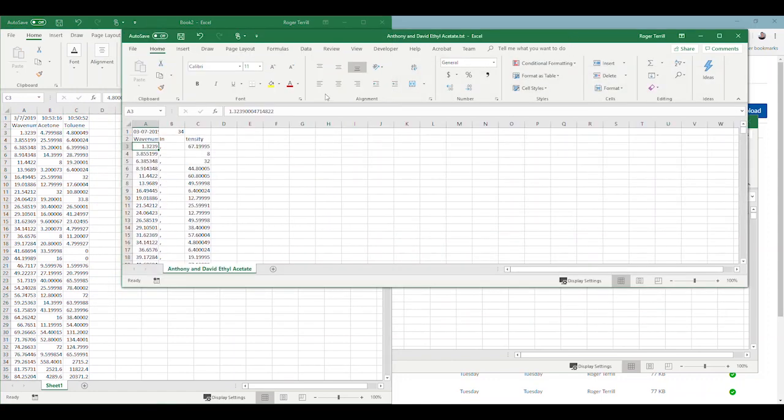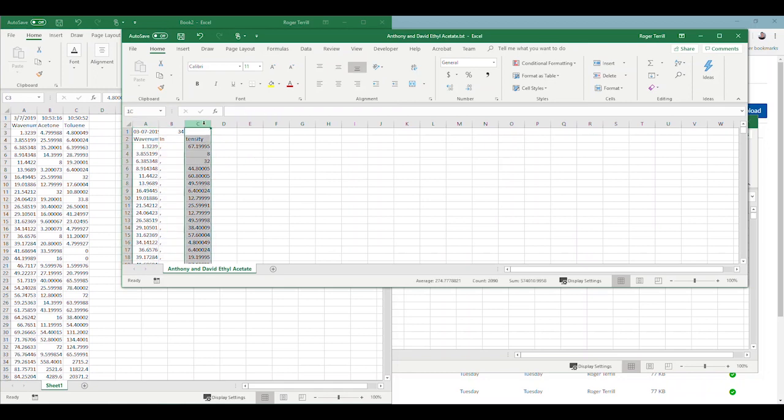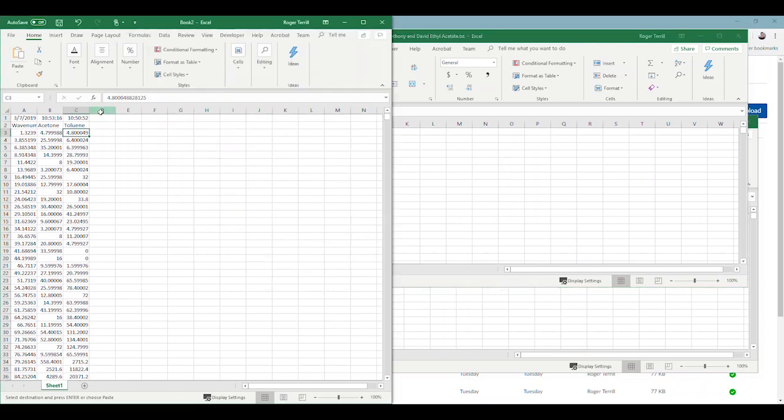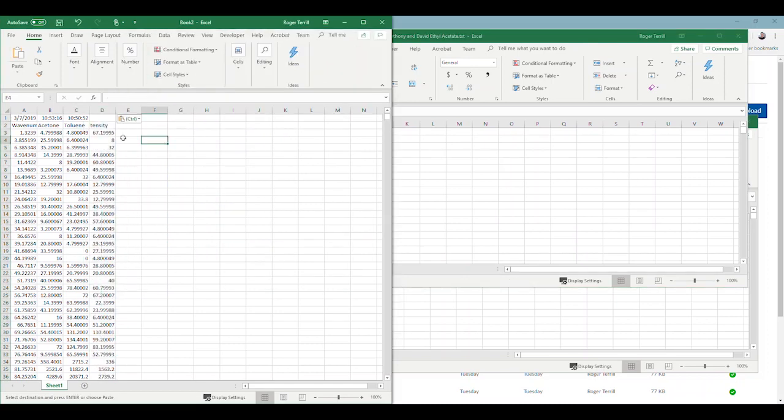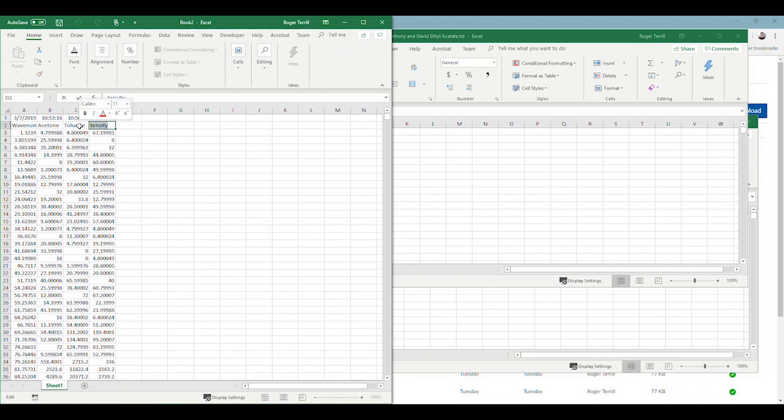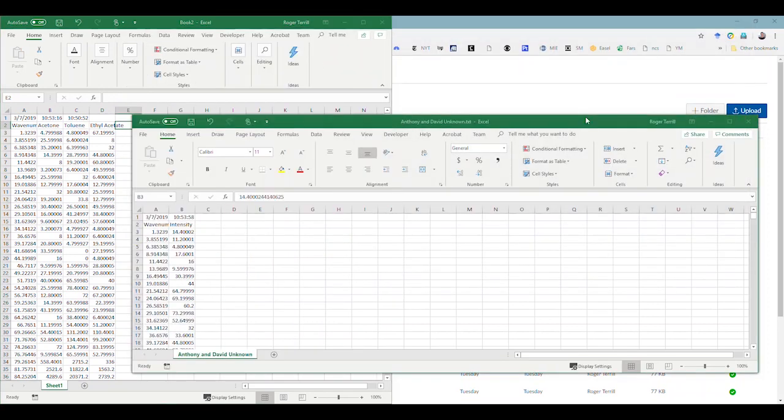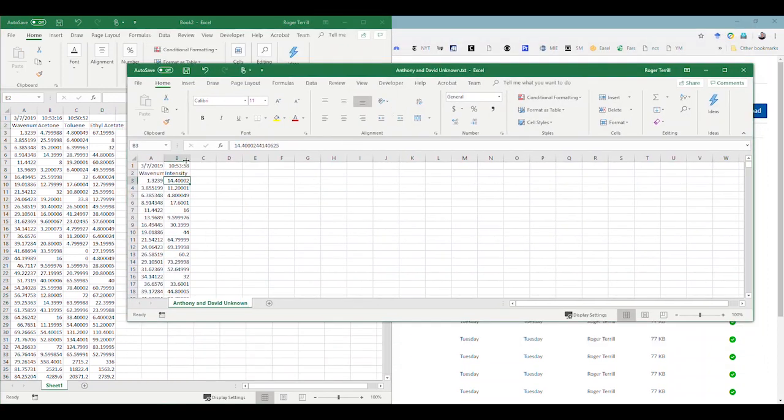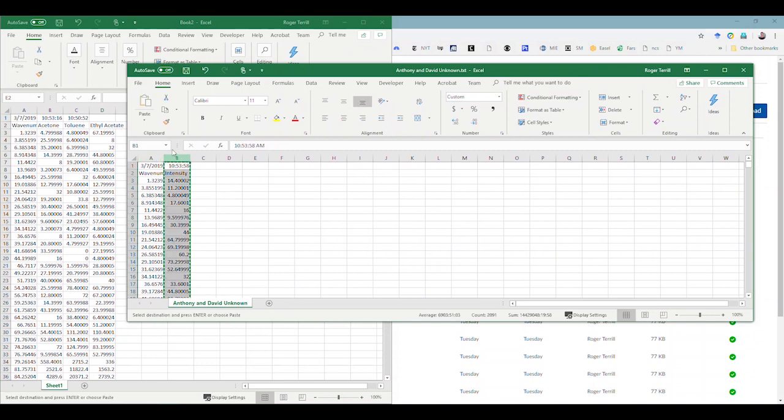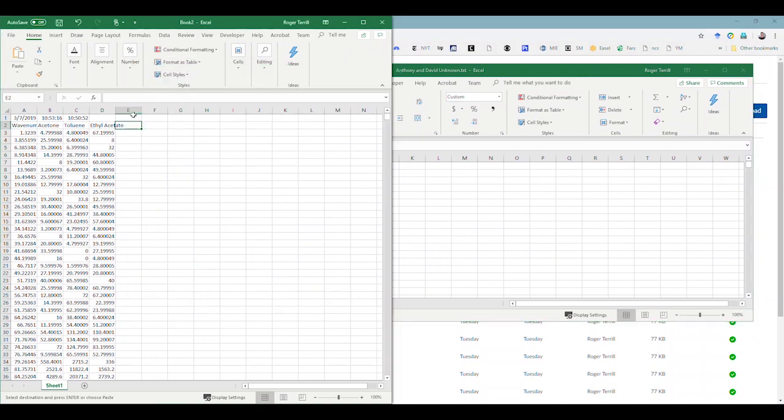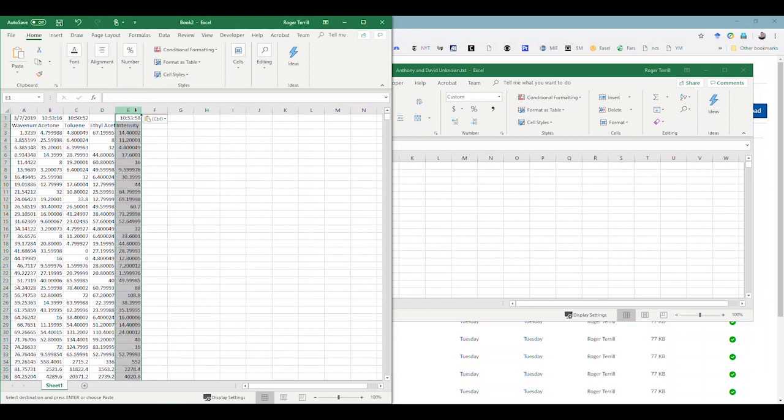Now I'm going to say instead of intensity there, I'm going to say toluene. And then ethyl acetate. I think it's okay. Let's say ethyl acetate. And then lastly, we'll do the unknown. There's the unknown. Control C, Control V. Here we go. Intensity, we're going to write unknown.